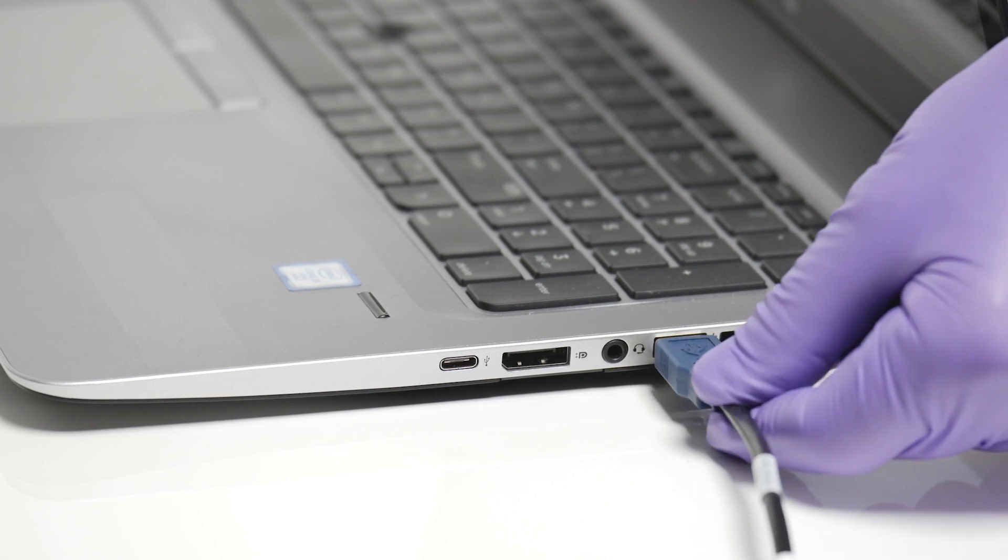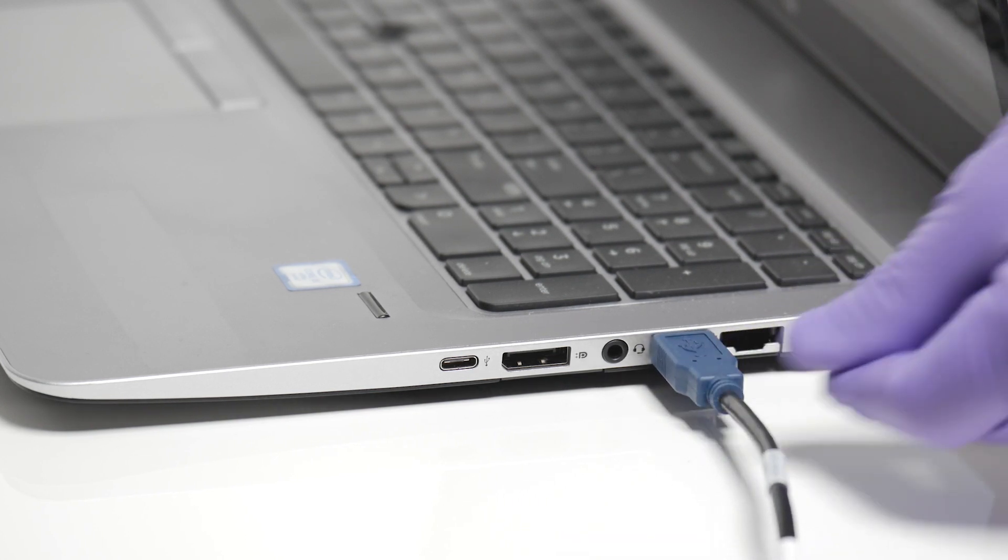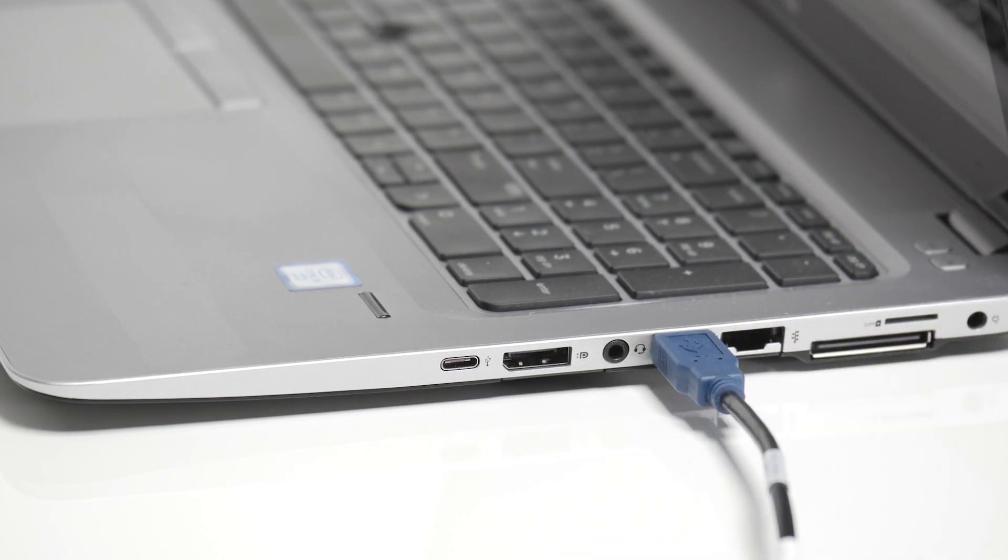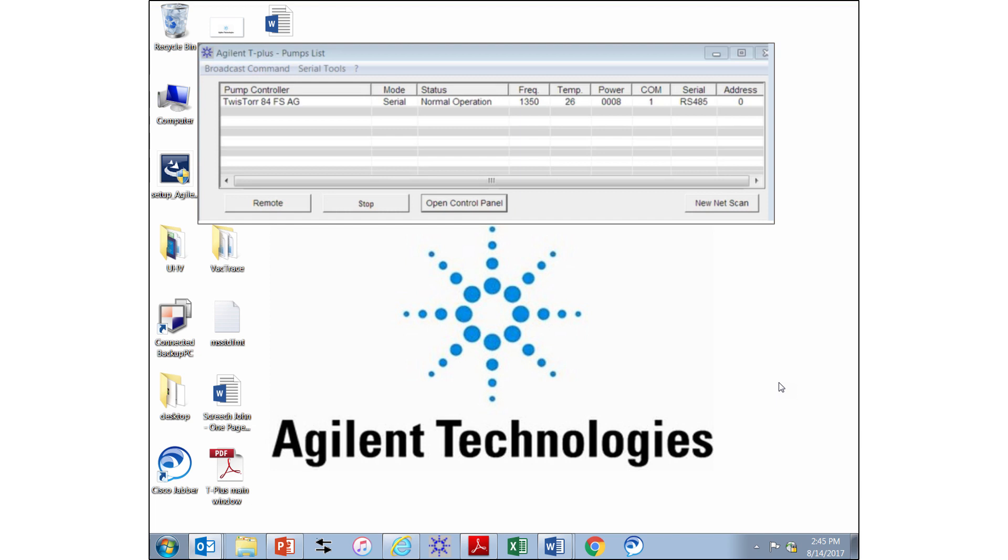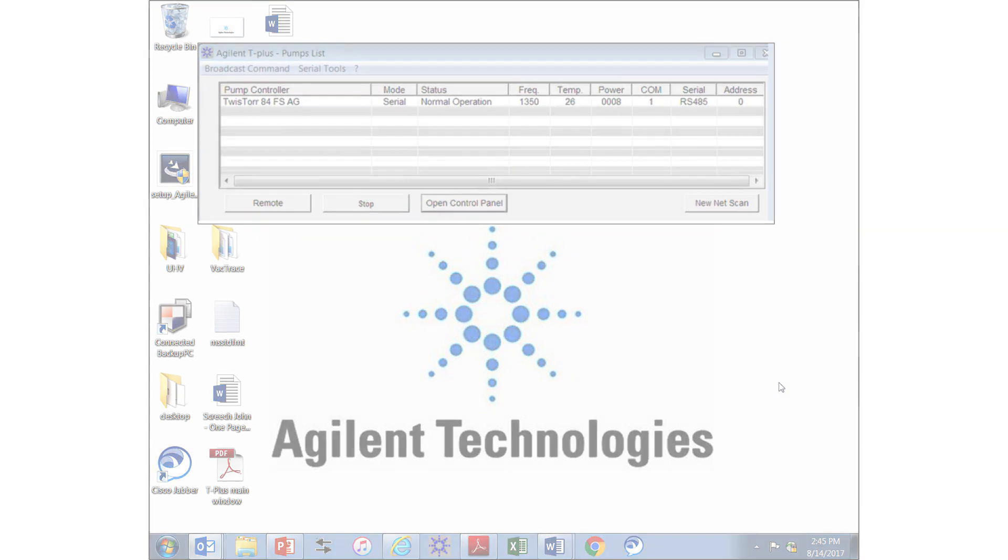You can get T plus software from our website, but of course I have it saved to my laptop so all I need to do is point and click. Here you can see the main T plus window showing the TwisTorr 84 FS pump operating parameters.